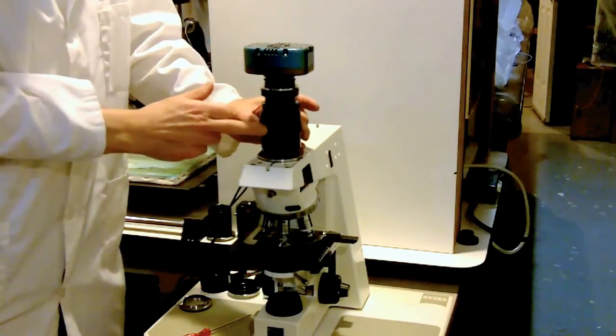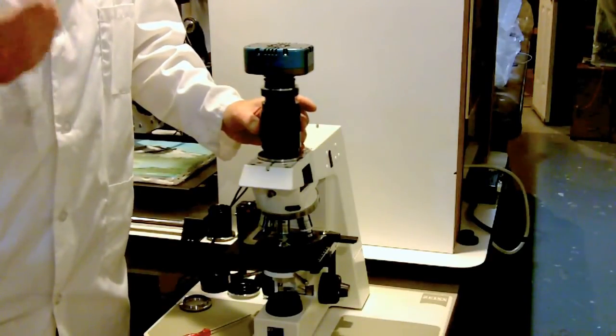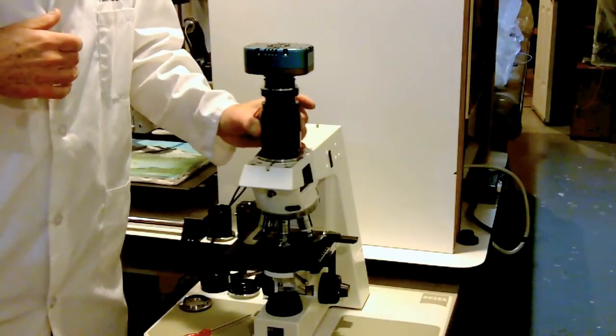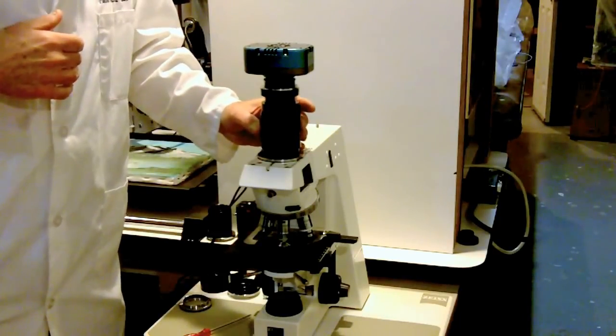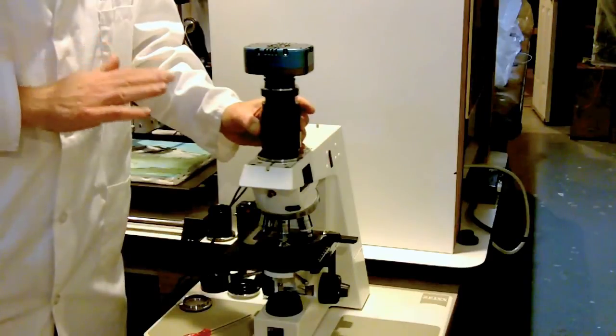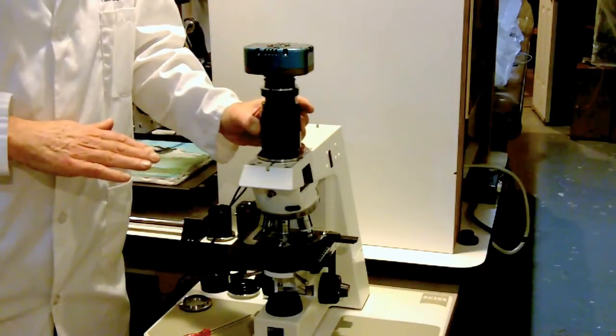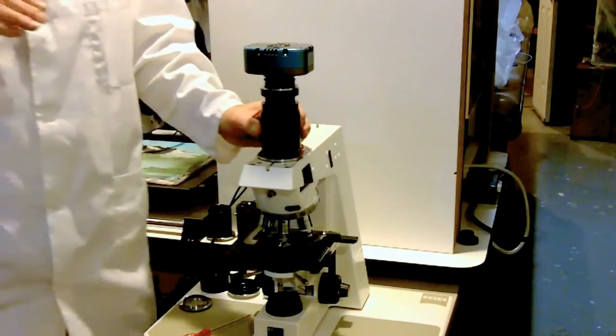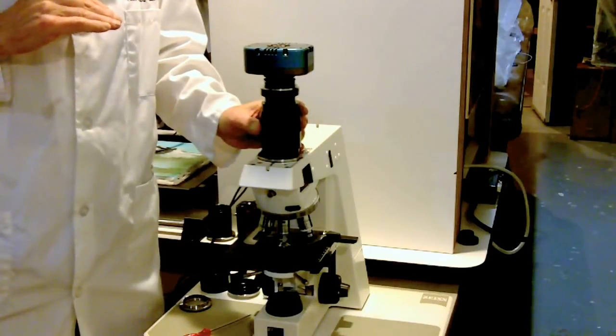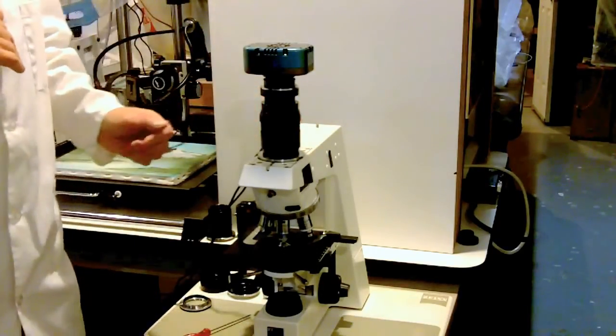So this ring right here allows you to use your mid-range dry objectives - your 20x, 25x, 40x, 50x, 63x dry objectives especially. And it solves the same problem that a cover glass correction collar would provide. So if you have objectives that do not have a cover glass correction collar, you can use this ring here to set the cover glass thickness properly for the objective to give you the best resolution possible without spheric aberration problems.